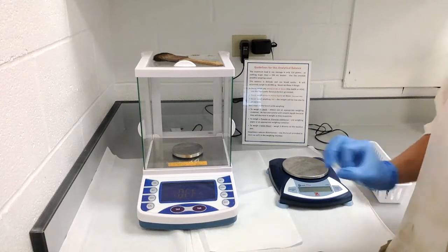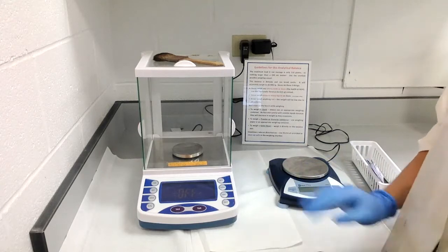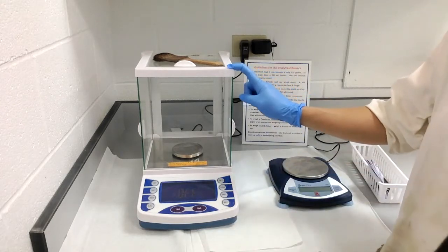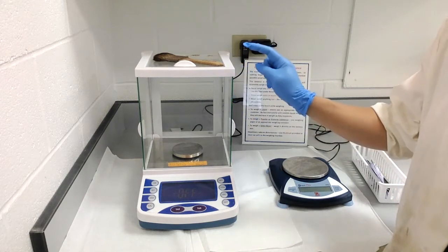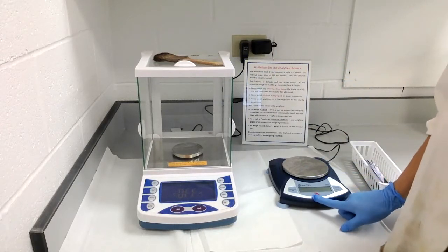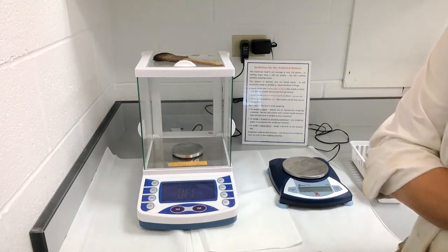The majority of your weighing will be done on the top loading balance; only a few times a semester will we use the analytical balance. These are very expensive pieces of equipment — the analytical balances run about $2,500, so you should be very careful and respectful when using them. The top loading balances cost about $400, so we don't want to overload or break them either.